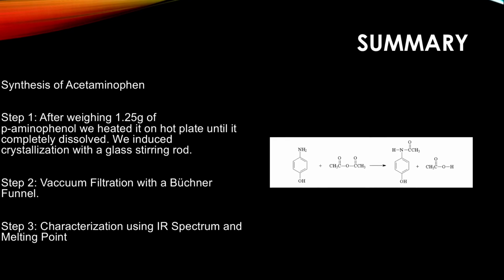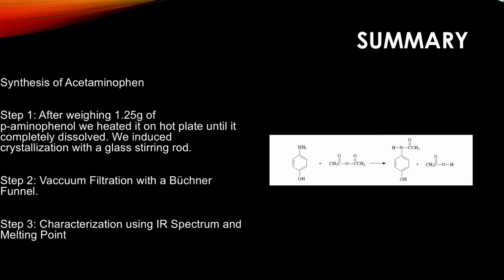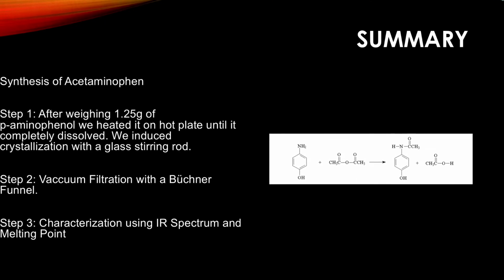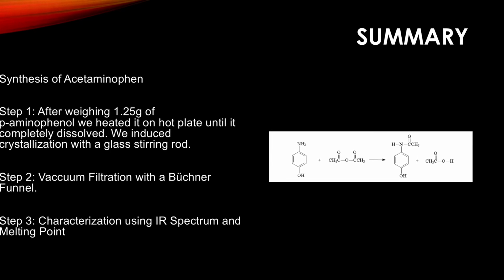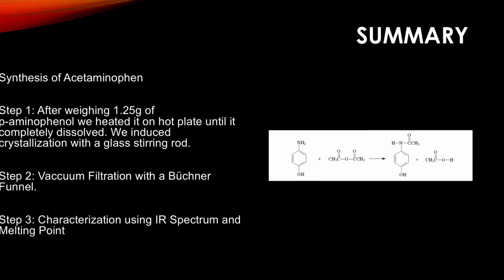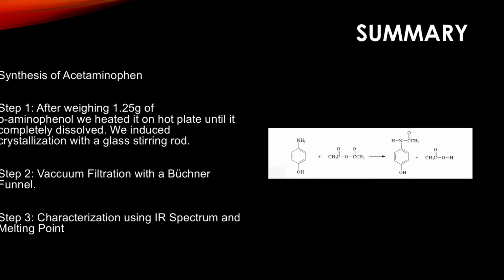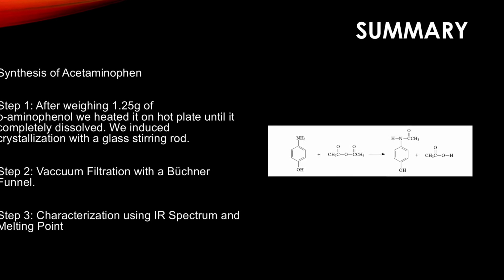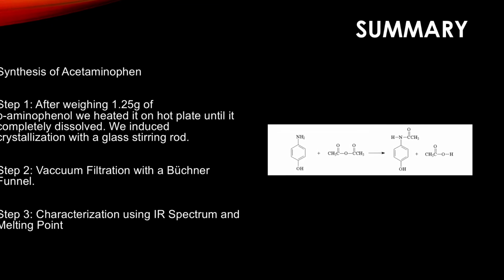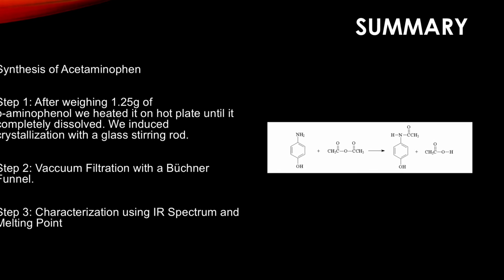After we filtrated and went through the experiment, I ended up making black tar. So I had to reconvene the following week to make crystals. After coming back, making slight modifications from the week prior to cut down steps, I was able to create nice, beautiful crystals for my characterization of IR spectrum and melting point.